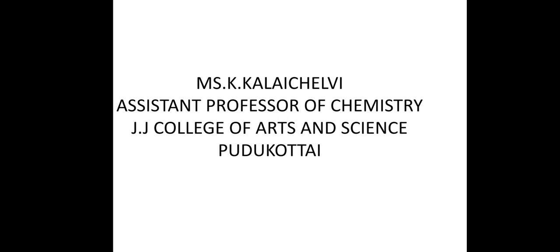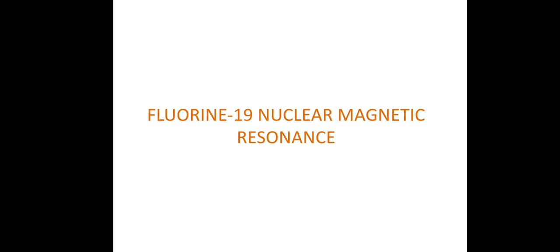Now we will discuss fluorine-19 NMR spectroscopy. First, we have to know what is meant by spectroscopy. It is an analytical tool to determine the structure of an unknown compound. It is defined as the interaction between electromagnetic radiation and matter. The electromagnetic radiation consists of both an electric field and a magnetic field. In NMR, we use radio frequency as the electromagnetic radiation. When we pass radio waves to the nucleus, resonance takes place between the nucleus and the EMR, that is, radio frequency.